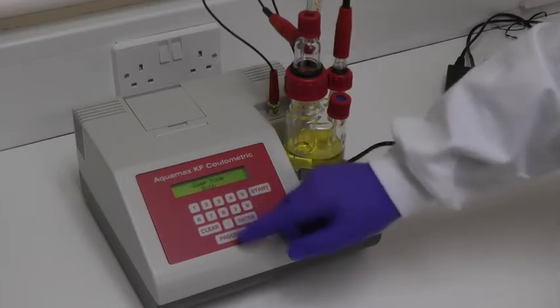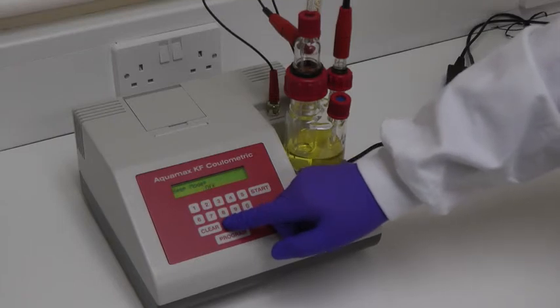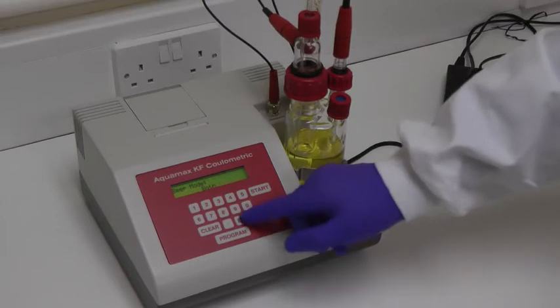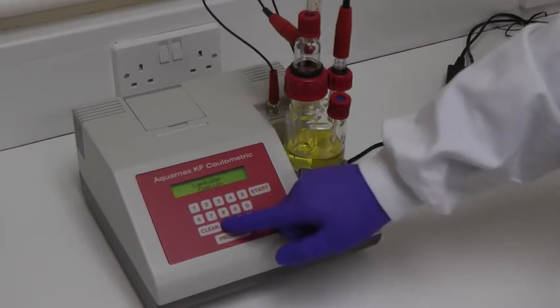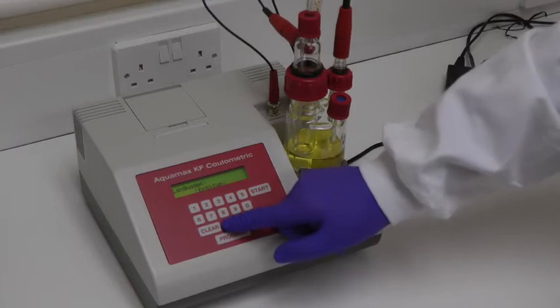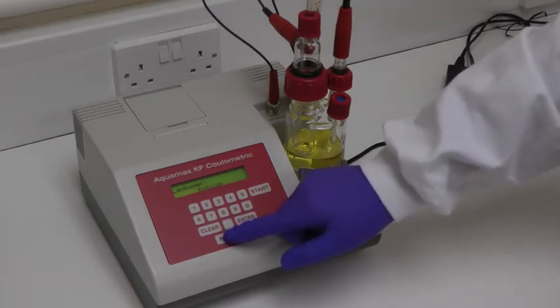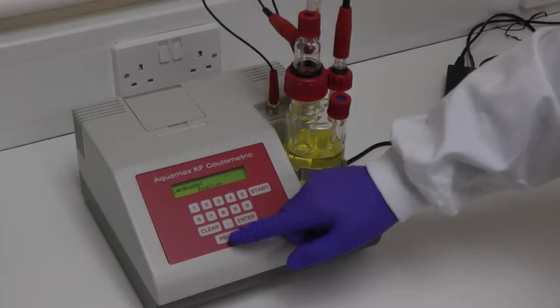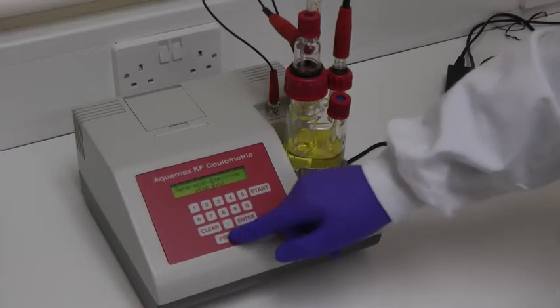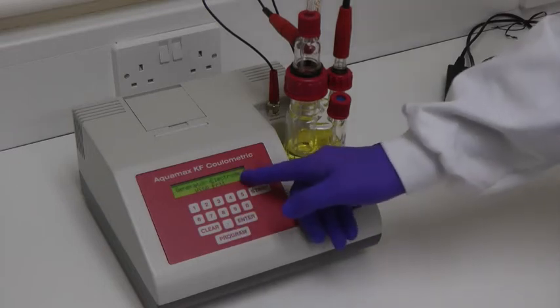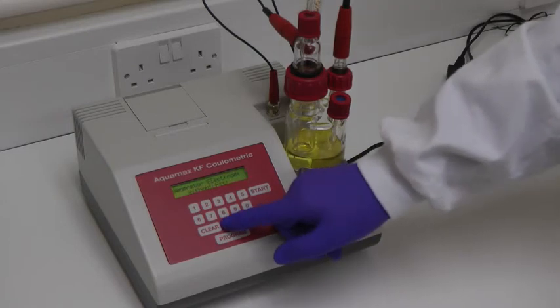The Beep can be turned off, set to sound when a key is pressed, to the end of titration, or to both. The Users Language can be selected from a list of all common languages. The Generator Electrode parameter can be set to either With or Without Frit.